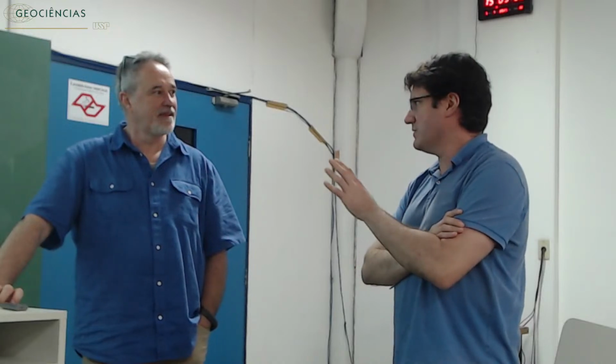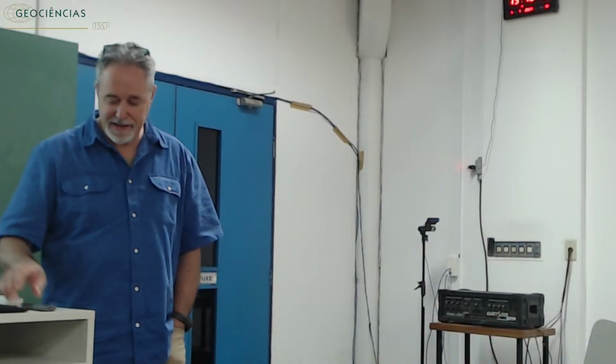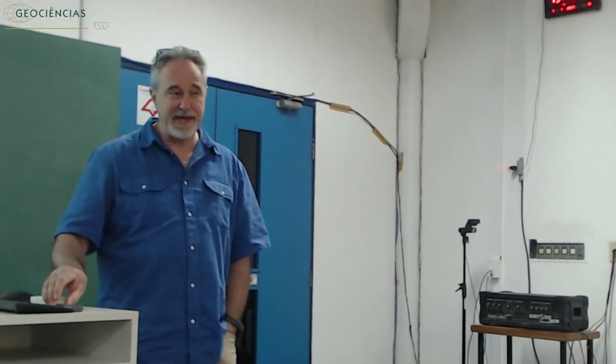Well, can I ask a question? Well, of course. You have shown many spectra on the K edge. Do you also work on the L edge? Because sometimes it gives more information on the neighborhood. What can you tell us about it? Okay, in the literature, it often says that iron L edge XAS spectra give more information than the K edge. Why?